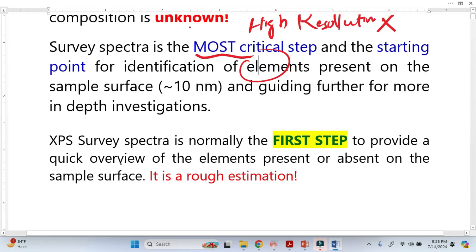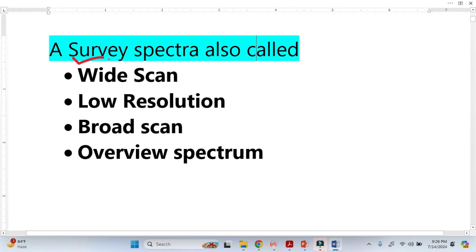This is basically the first step to provide a quick overview of the elements present or absent on the sample surface. It is basically rough estimations. The survey spectra is also sometimes called wide scan because we use wide range binding energy.